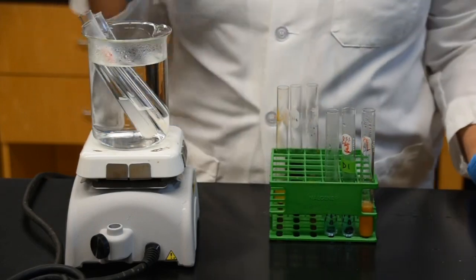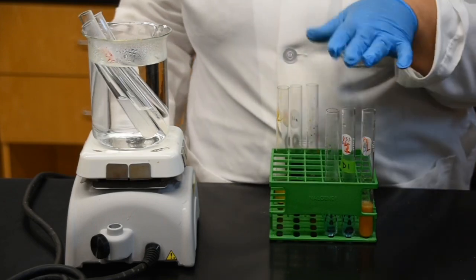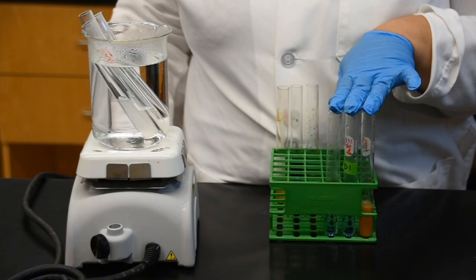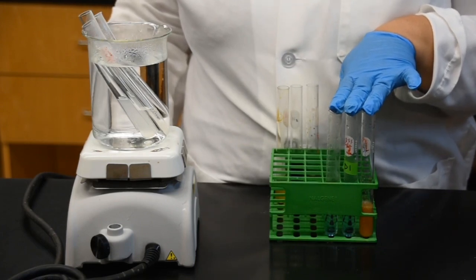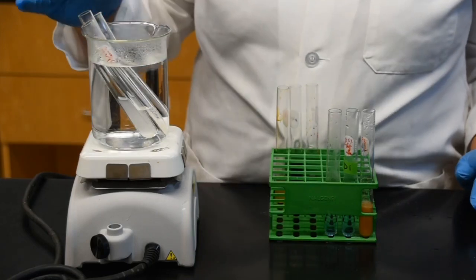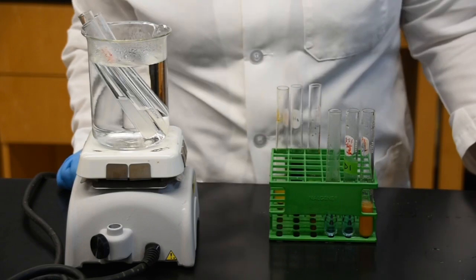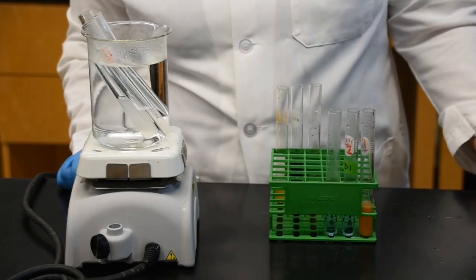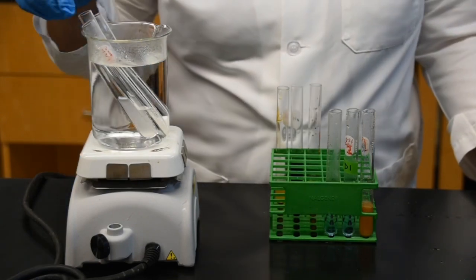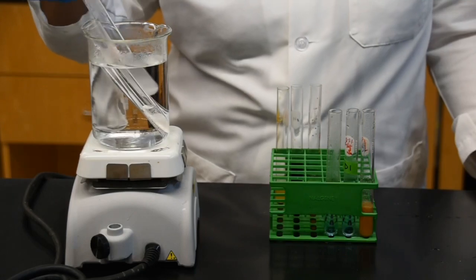So basically, while we're waiting for this to heat up, I want to go over this with you one more time. The 2 samples that you will be heating are your sample for the Benedict solution as our indicator, and the second sample is your ninhydrin sample. A starch sample does not need to be heated. If starch is present, as soon as Lugol iodine reaches it, you will expect to see a color change. So we're going to leave these samples be for a few minutes.